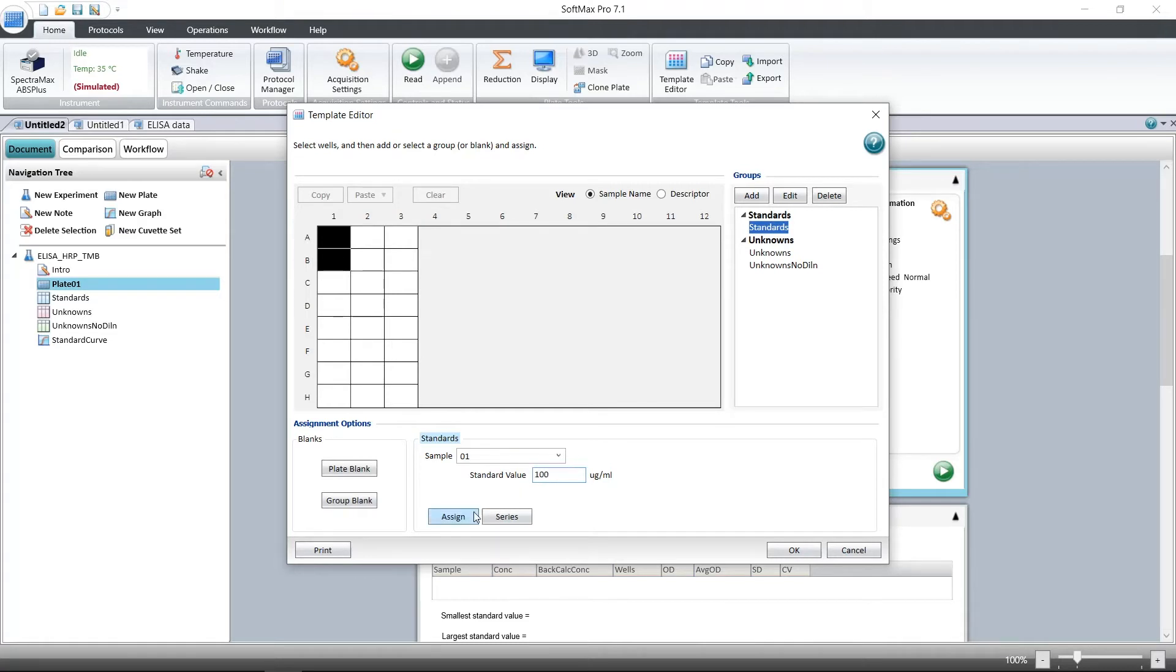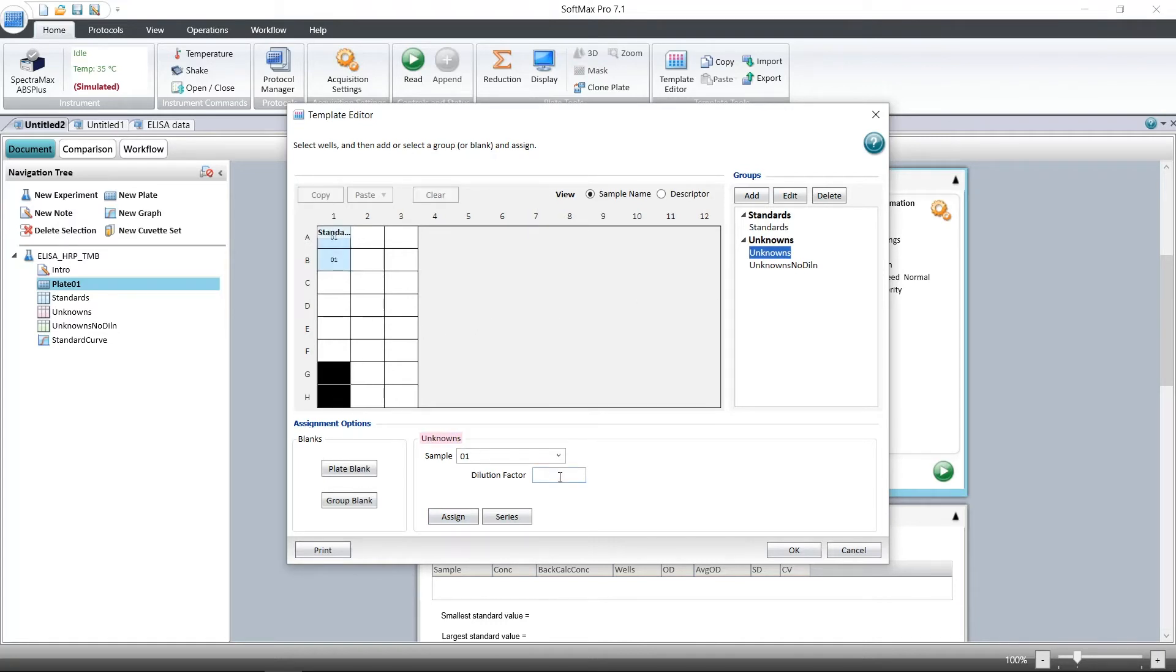We can also assign the wells as unknowns, the samples we want to analyze, and any dilution factor that may be applied. We can choose to set up the template now or we can wait until later after we've already read the plate.